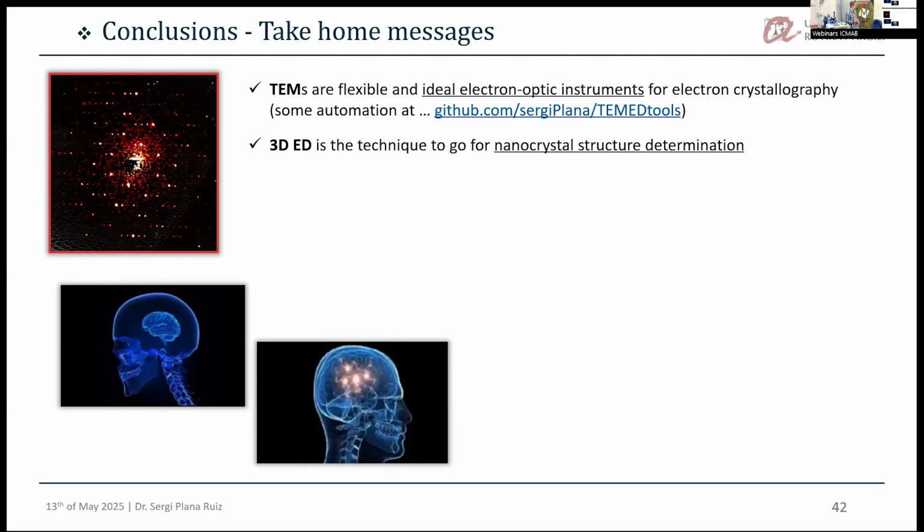Then 3D ED is a technique, I think, to go for the characterization of nanocrystals. If you have a big piece of crystal, or not that big, for sure go for X-ray diffraction. It doesn't need to go everything to electron diffraction. Even if they are very big, you will have to just crush it. So don't do it, right? You just go to X-ray diffraction and you do it. But when you have very small things, nanocrystals, for sure electron diffraction can really help you in order to determine the structures for these materials.